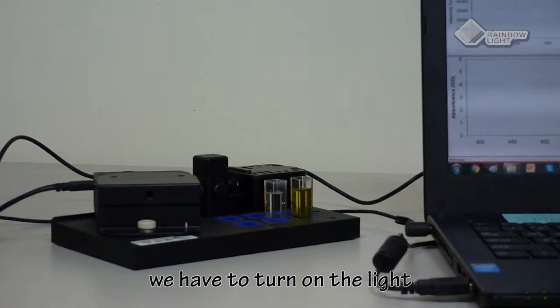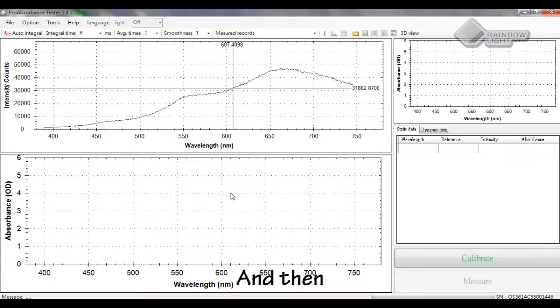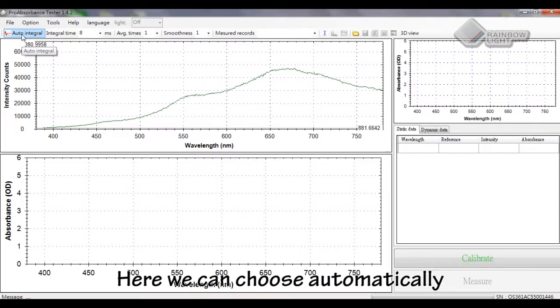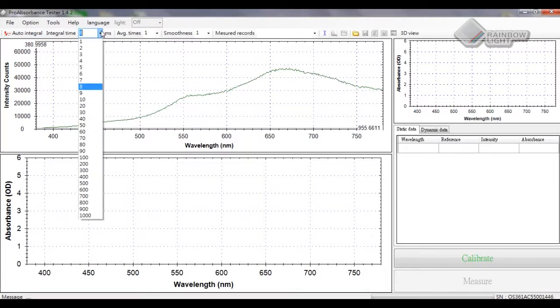Now we are going to introduce its software. First, we have to turn on the light. And then set up the integration time before measuring. Here we can choose automatically or set it up manually.